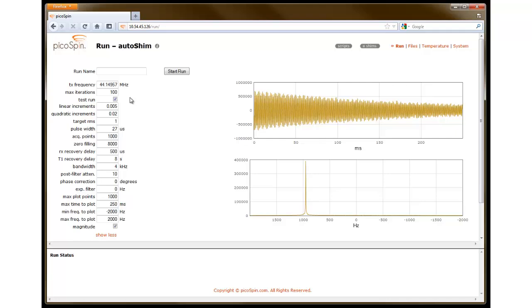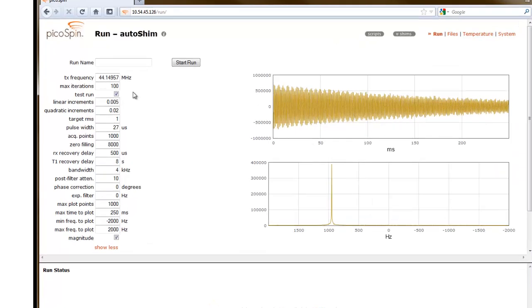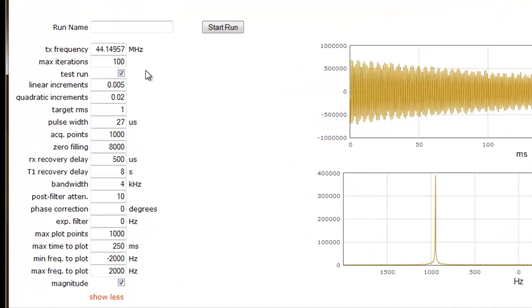The values that appear in the parameter fields will be the last ones used in the script. Next, we want to make sure that the Test Run option is selected. If it isn't, then simply check this box. We'll uncheck this option later when we're ready to do a full shim.